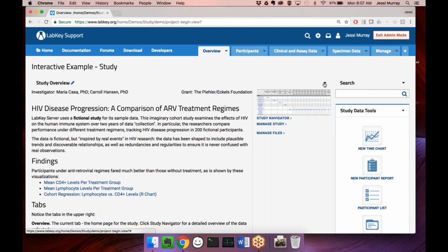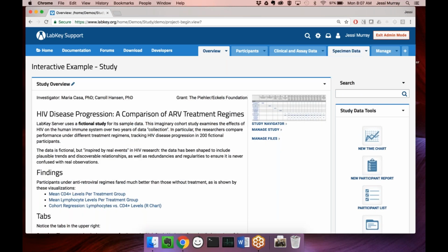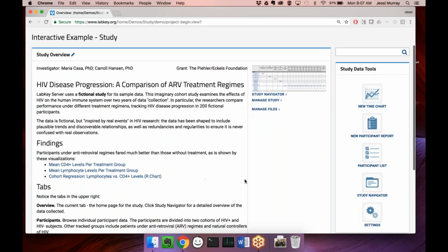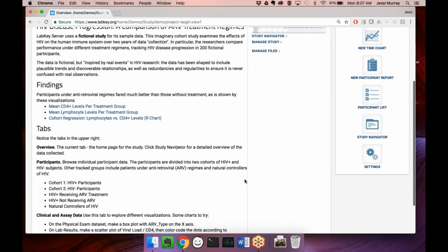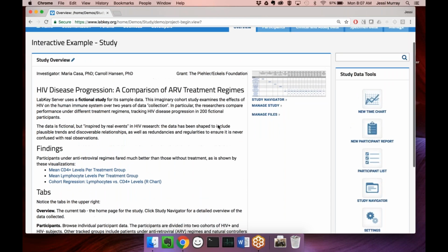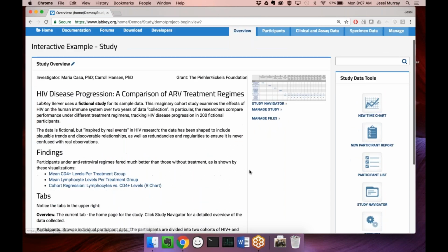We do have special behavior available for Wiki Web Parts.